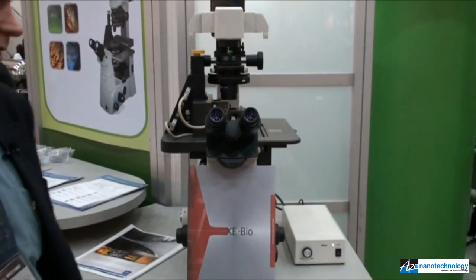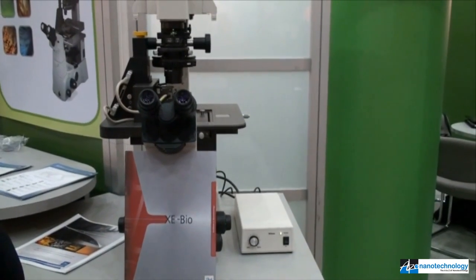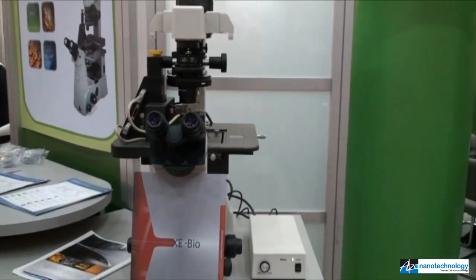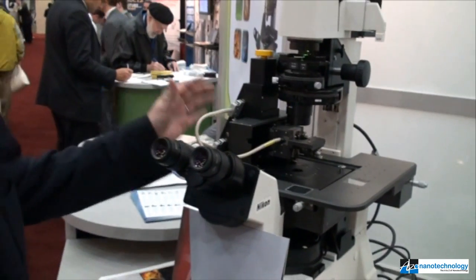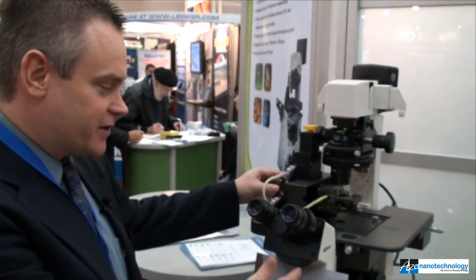The XE-Bio is our most recent product, and this system is aimed at people doing work in life sciences, looking at live cells, imaging in liquid, and also people that are familiar with standard optical analysis techniques. In essence, we've combined our AFM platform, the XE-Bio stage, with an inverted optical microscope.